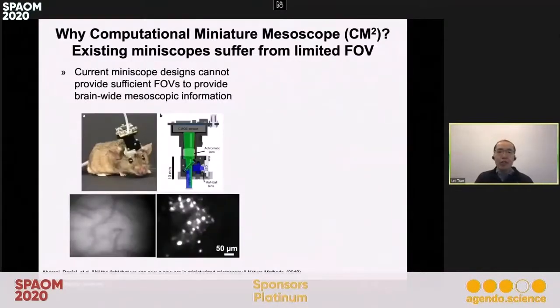So why do we do this? Let me give you a little bit of broad perspective, and then I'll dive into the techniques we are building. Generally speaking, as I mentioned several times, we're interested in wearable microscopes. If you look into the field, there has already been a lot of interesting work done in the past 20 years.